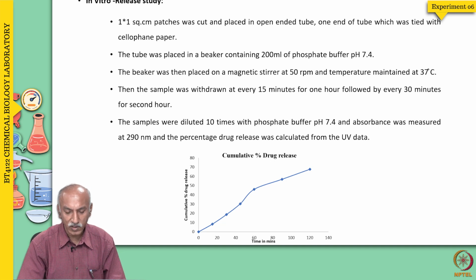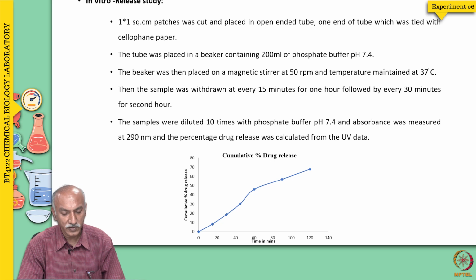So, you can find out that the drug is getting slowly released from 20 minutes to about 1 hour, and by about 2 hours, about 70% of the drug is released from the patches.